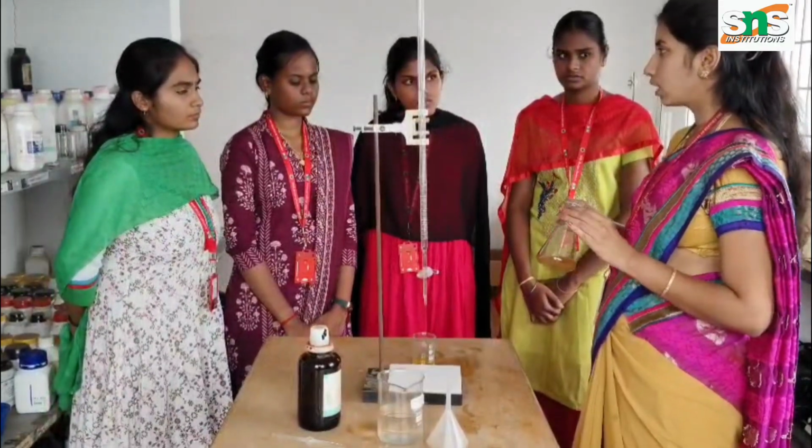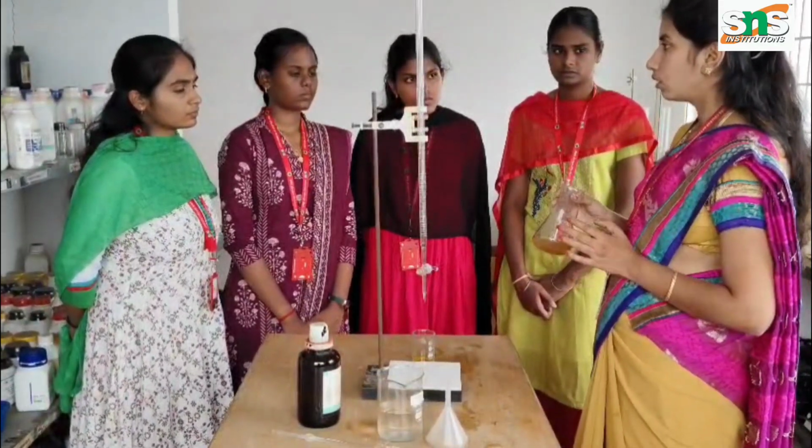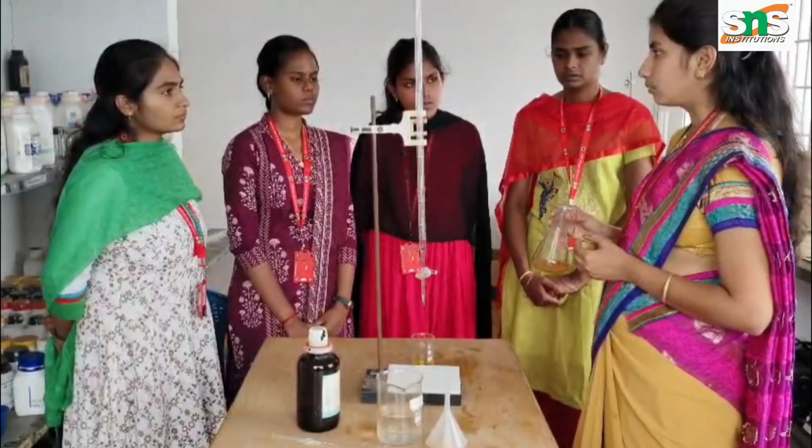So this is the procedure to conclude this experiment: what the water sample is, and why we determine the chloride content.